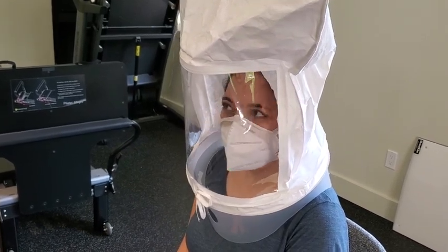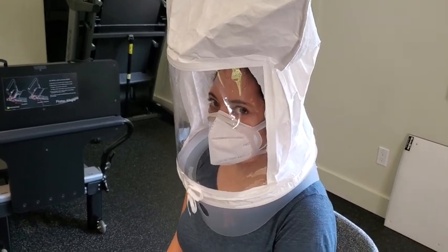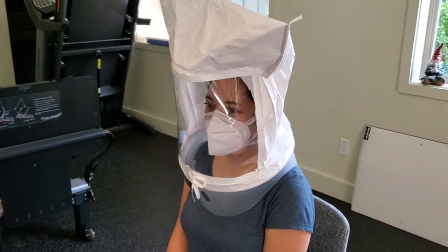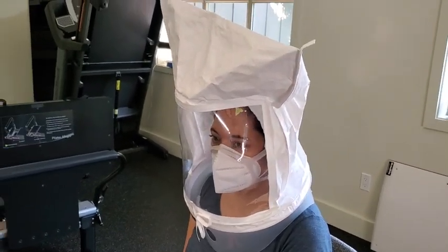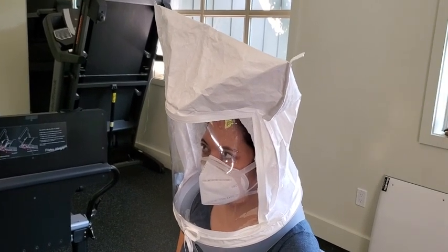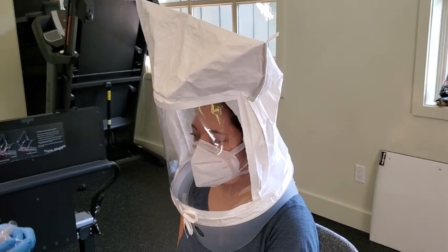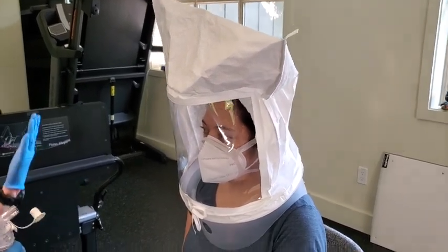I taste it now. Finally. Okay. We're keeping going. Just keep going, but switch to the sensitivity solution, just so we're not blasting her. So we know that that doesn't work. Okay, so same thing now, but head up and down.